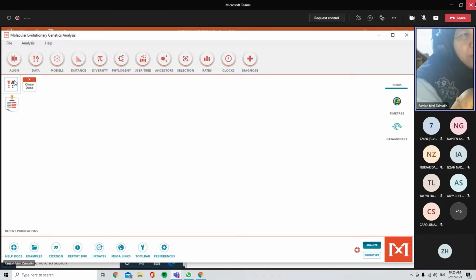Okay. Sometimes MEGA boleh buat remove the whole thing. They will remove the three nucleotides, and you save that one for your further analysis. But sometimes dia tak boleh buat. Bila you tak boleh buat, you have to go back to your notepad, the text file, and you remove that position, and you do the alignment again. So memang dia akan tedious. So this preparation of file is quite tedious, so that you get the correct sequence for the analysis.